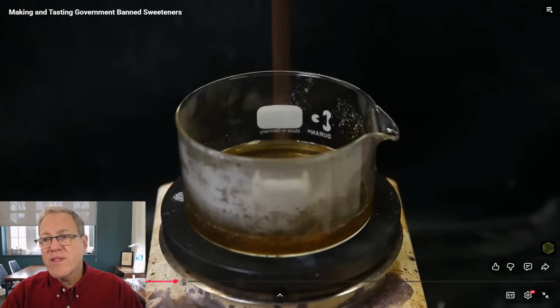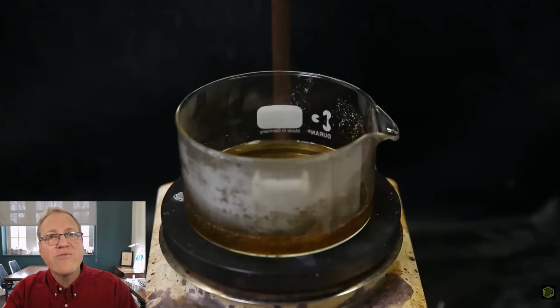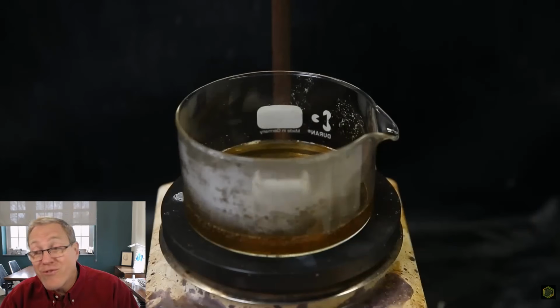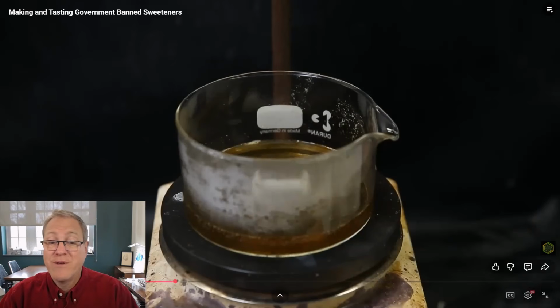It's interesting. He likes these big, wide evaporating dishes. I tend to be more of a beaker kind of person. I like a higher wall and a smaller surface area. He likes the higher surface area. In the end, it doesn't matter. It's what you feel most comfortable working with in lab and what works for you. But there are different styles. People who practice chemistry, we all have our own preferences, and sometimes we do things a little differently, but as long as we get the job done, who cares?